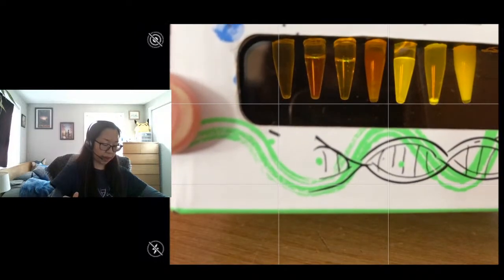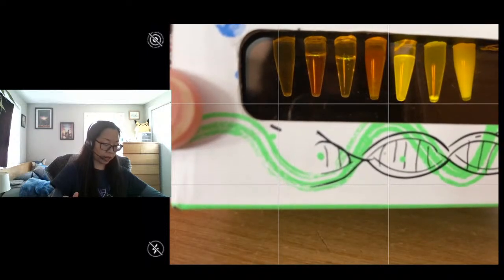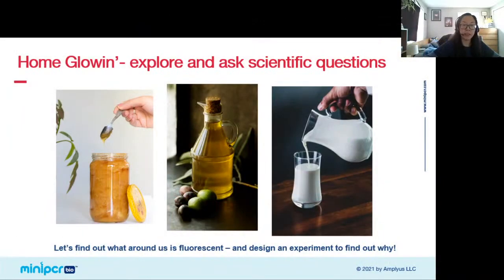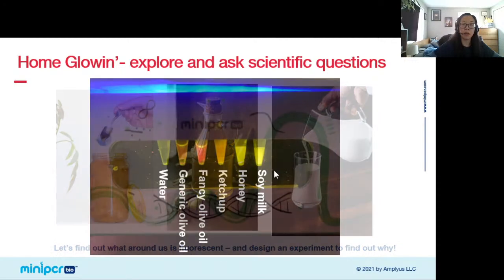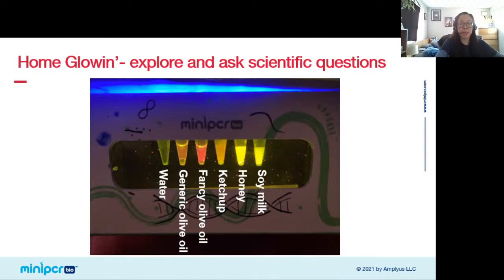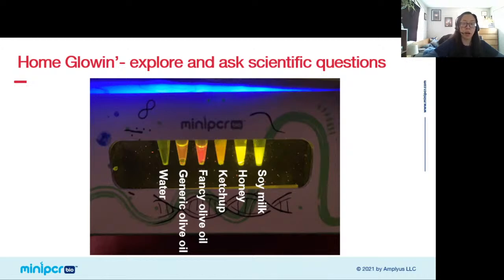That's just stuff I grabbed around my house and put in here — I didn't even know this stuff was fluorescent until I tried it out in the p51. And while it may seem pretty simple — just putting foods in tubes and looking at them under blue light to see them glow — it actually provides the foundation for students to take it a step further and actually design an investigative experiment into why they saw the fluorescence they did.